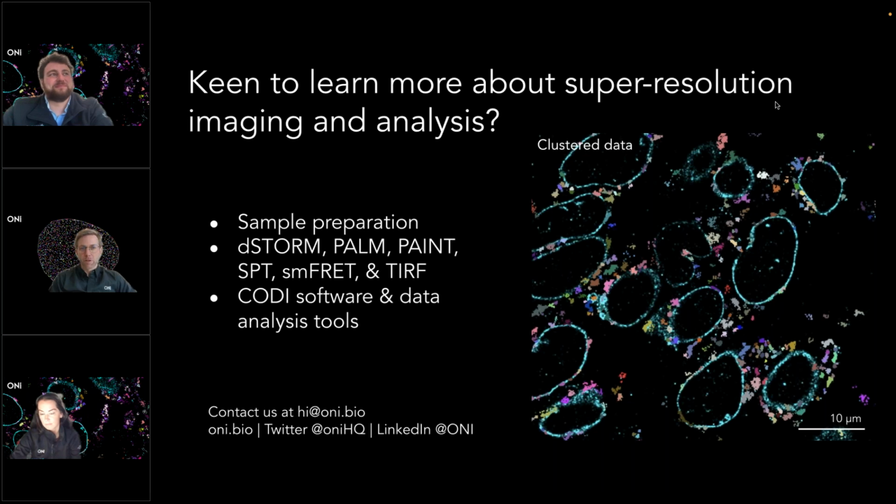The example that I was giving earlier about T cells, where they were looking at PDL and maybe a different capture antibody. Nearest neighbor analysis is really interesting to be able to get the distance, obviously, between clusters that are adjacent, but it can also give you an indication of the homogeneity or the heterogeneity of the distribution of those clusters. I don't want to lose everybody here, but basically it can tell you, are those clusters homogeneously distributed by looking at the nearest neighbor, the second nearest neighbor, or the third nearest neighbor? Or are they heterogeneously distributed, meaning are they kind of in packets in different places? So nearest neighbor analysis is really interesting. And again, stay tuned for more on that.